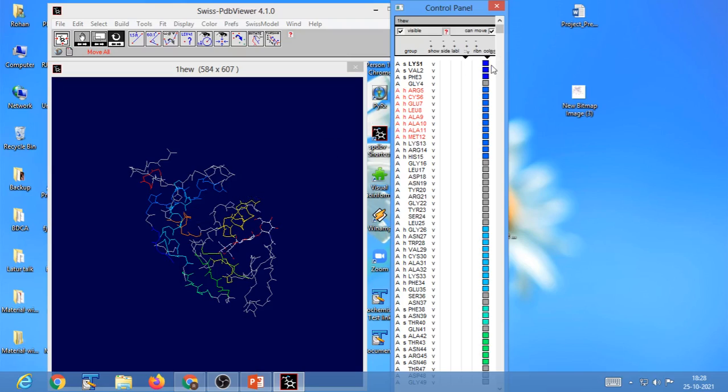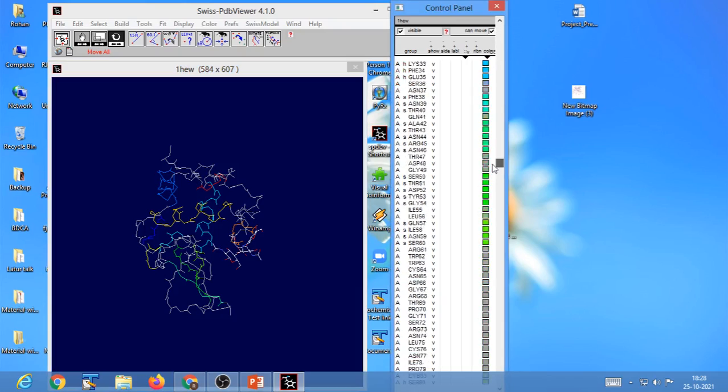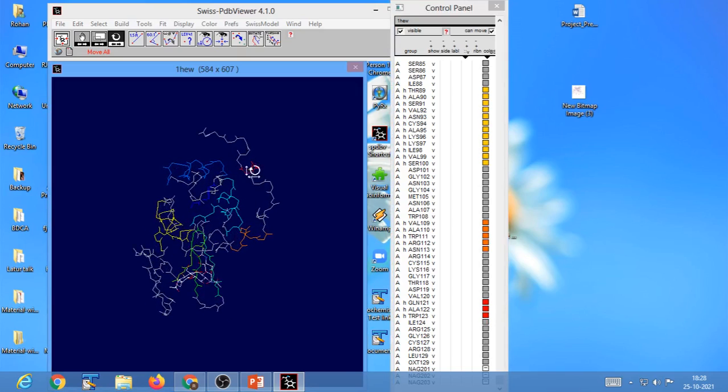The residues that are colored in a shade of blue or violet are the N-terminal residues, and the secondary structural elements that are colored in a shade of red over here are the residues present at the C terminal. In short, DeepView assigns as many shades as needed for the number of secondary structural elements present between the N terminus and C terminus according to your visible spectrum.